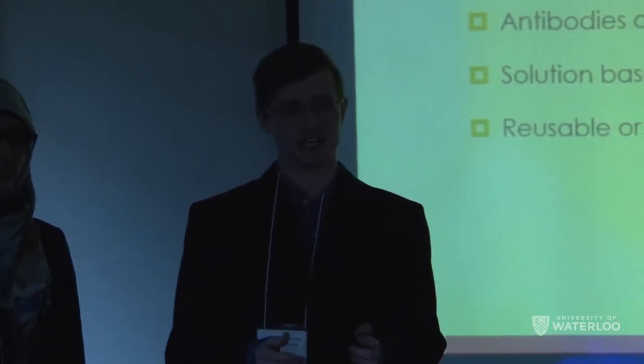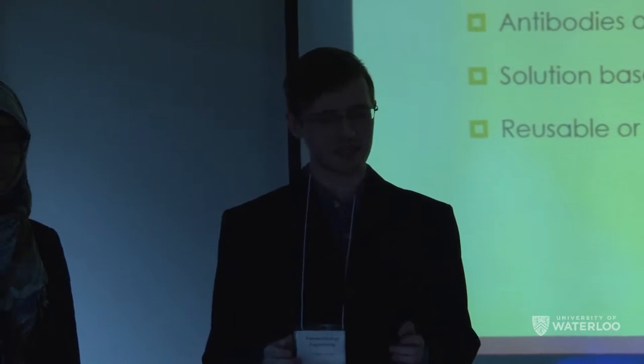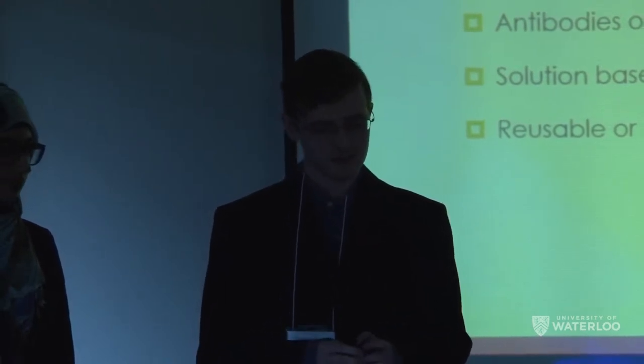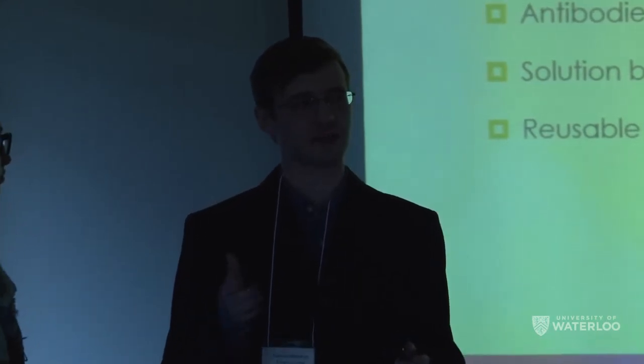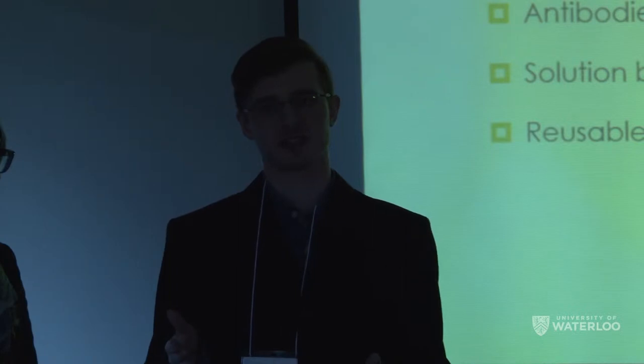The next question is, should our device be based on solution or work in lateral flow? Solution devices that you may have seen are the pH-dependent dyes used for titration, whereas a lateral flow method tends to use a membrane. It's things like pregnancy tests. And finally, should it be reusable or disposable?